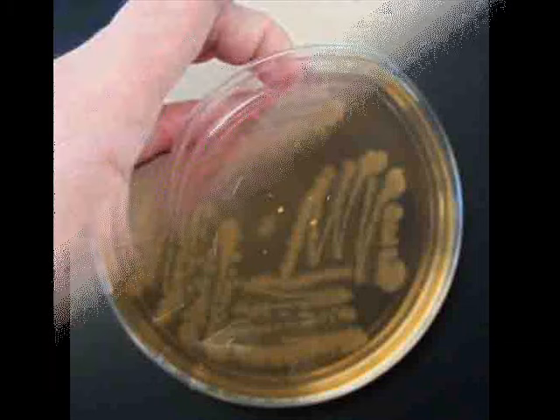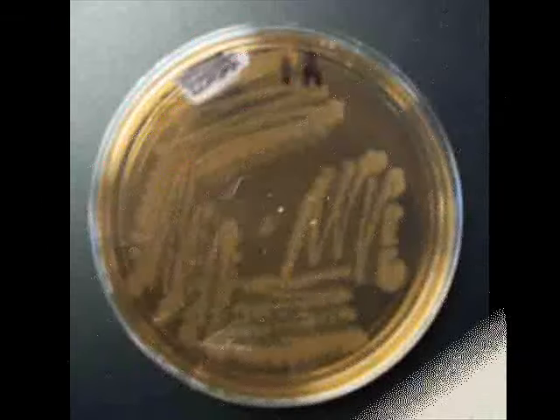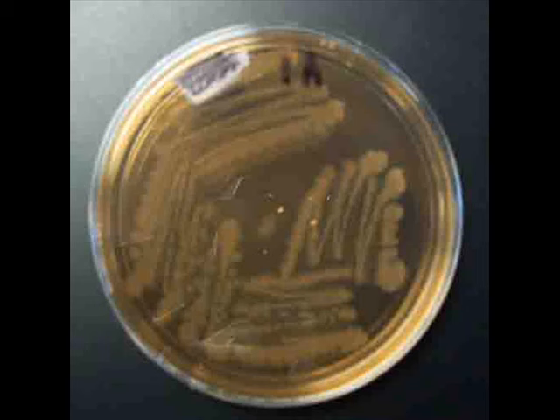This happens once you incubate the MacConkey's. Here's the nice, cheerful soft pink color it starts out as. So if there's no growth on the MacConkey's after incubation, or if there is non-lactose fermenting growth, you'll get this dingy color to the medium itself. This has nothing to do with the differential reaction — we're looking at the bacteria to change color for that. This color change in the medium is just a product of time.